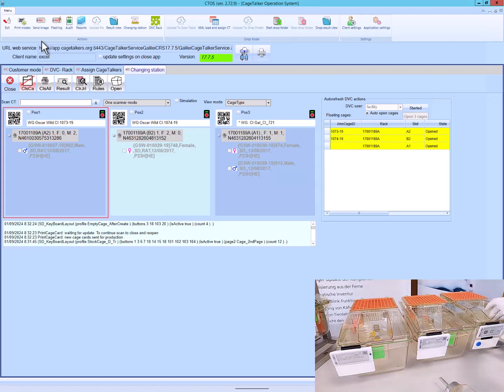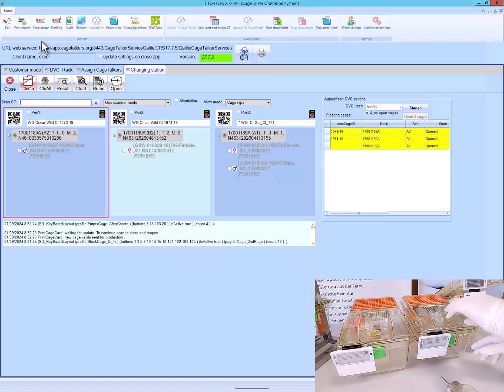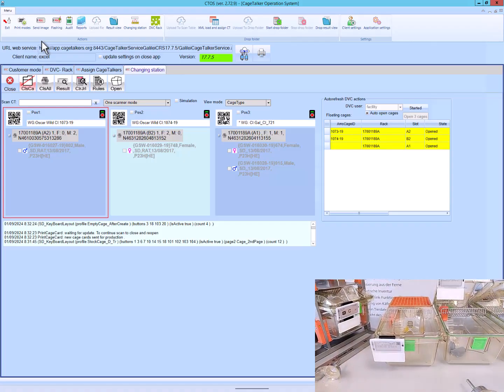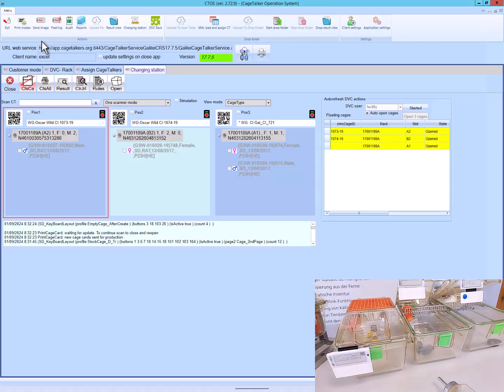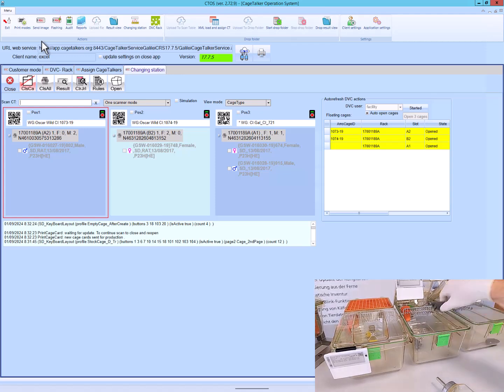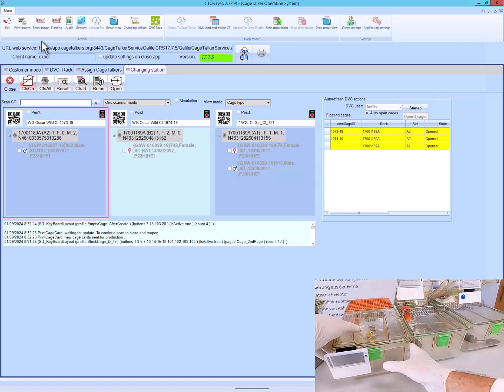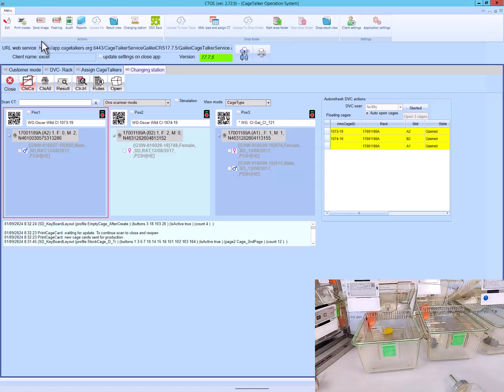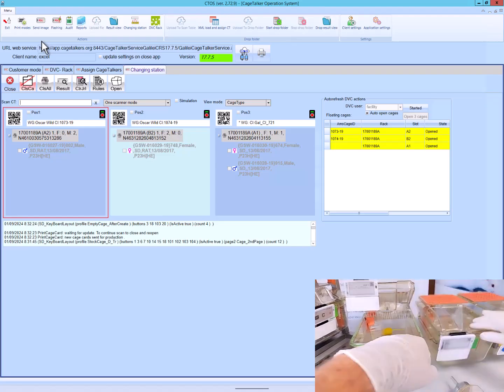This means that we open the cage, we can see how the card is currently changing. Please note that the documentation was provided in 2 steps. The user can now physically carry out the transaction while the cage cards are updating, as if using a teleprompter. And during this time, the male and the female are physically moved. After this, we can now close all the cages. The transaction is complete.